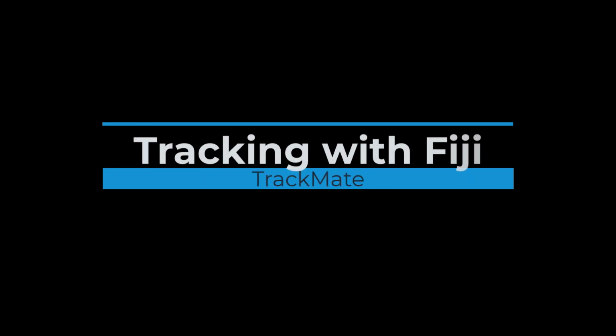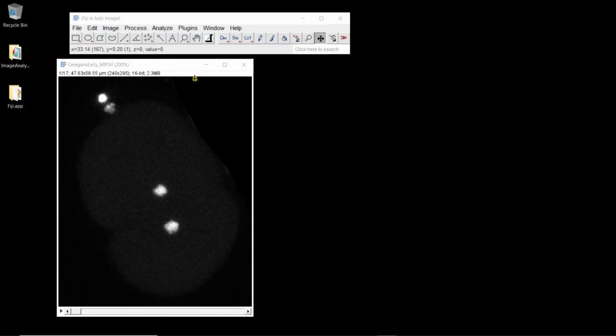In this video, I'm going to show you how you can perform tracking with TrackMate. So we're going to use this very simple image sequence of a C. elegans embryo, where it comes from a 3D volume, a 3D stack over time, but here is just the maximum intensity projection. It's going to be fine for what we want to do.